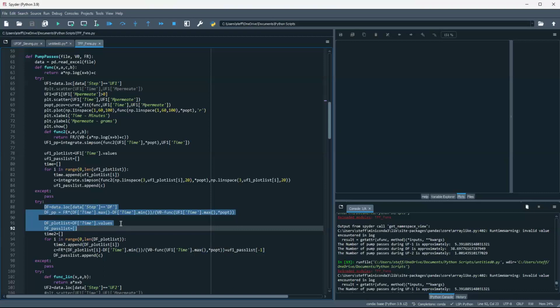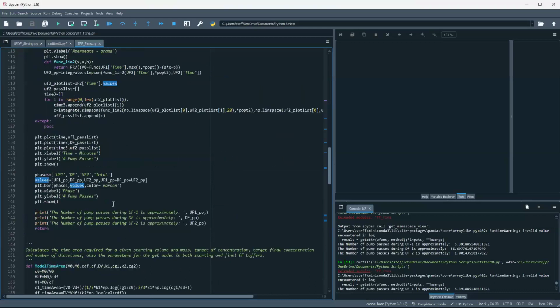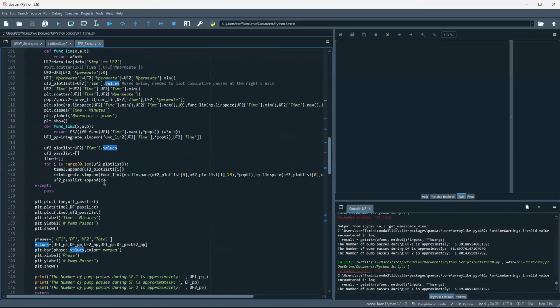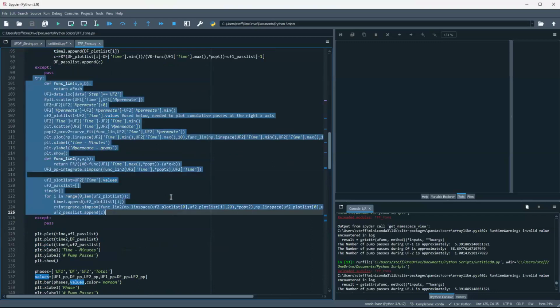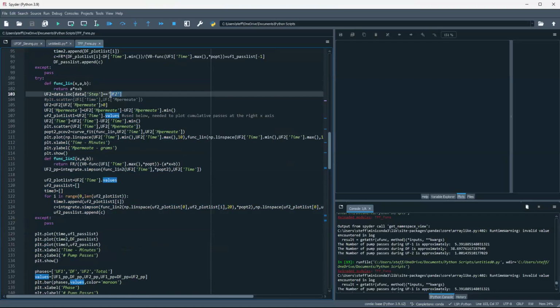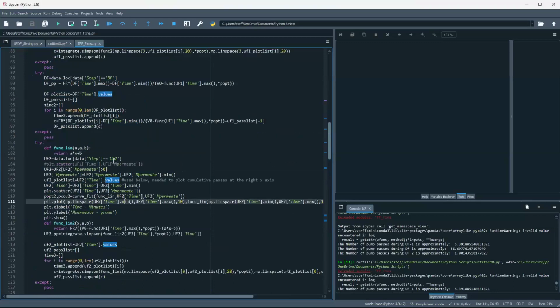Here, it's just using that basic calculation I showed in the very beginning, where you just have the feed flow rate times the time of diafiltration divided by the retentate volume during diafiltration. That calculation is super easy. And then it finishes up with the UF2. So it looks for that UF2. So it's important to have those.